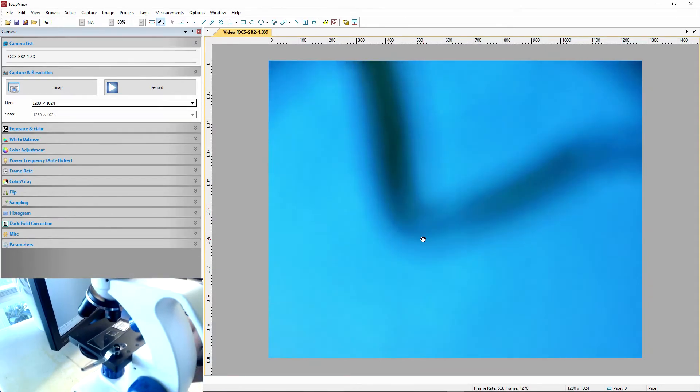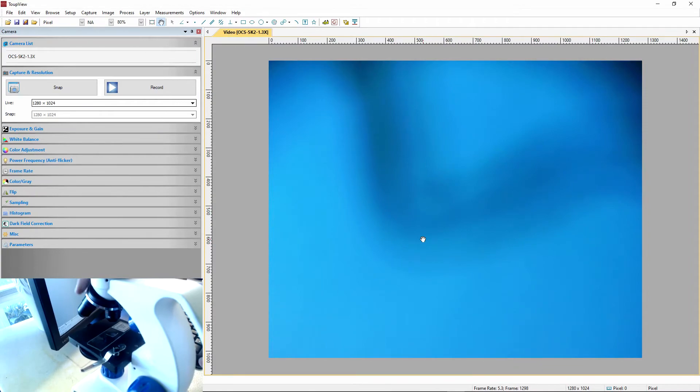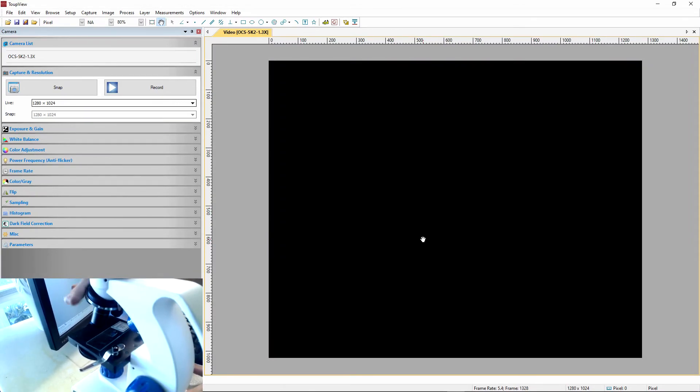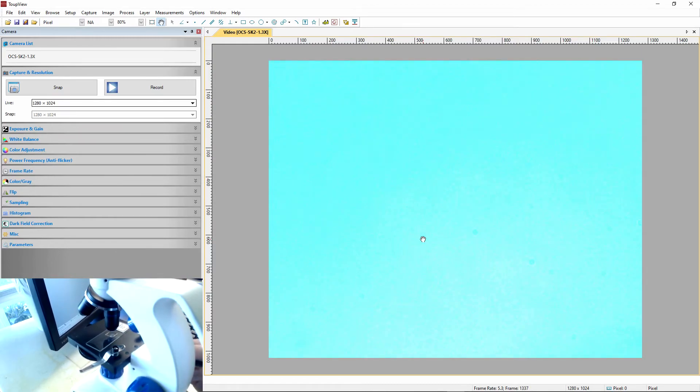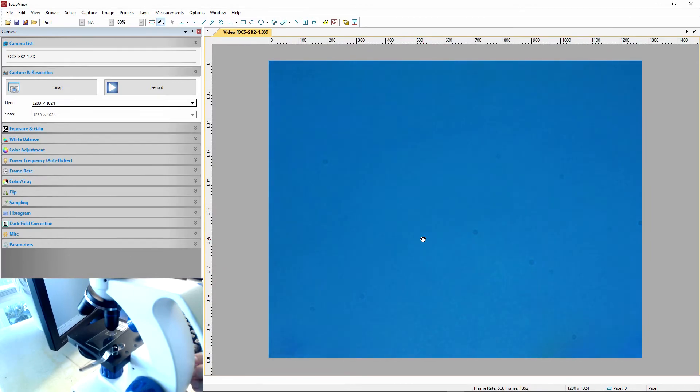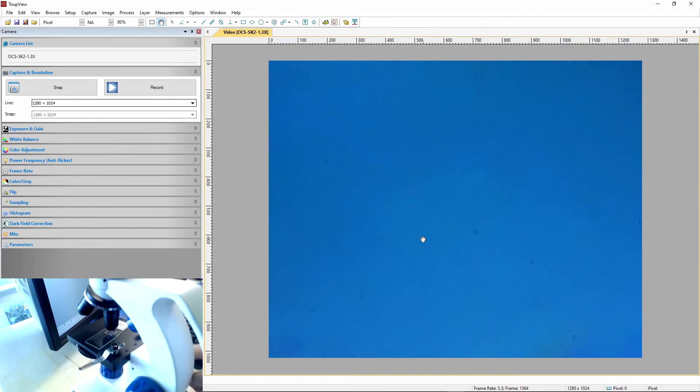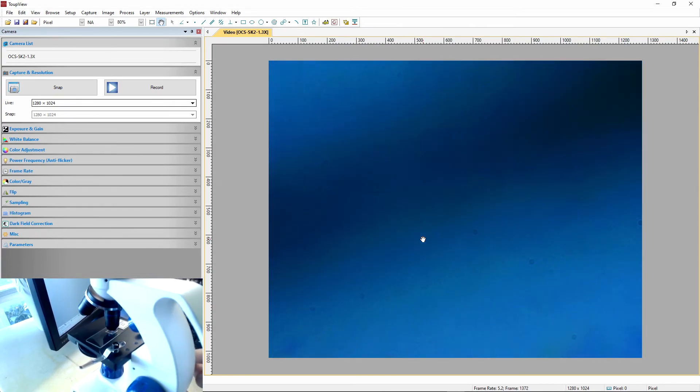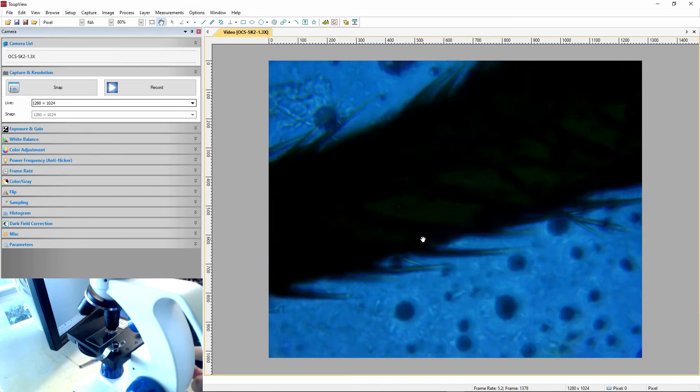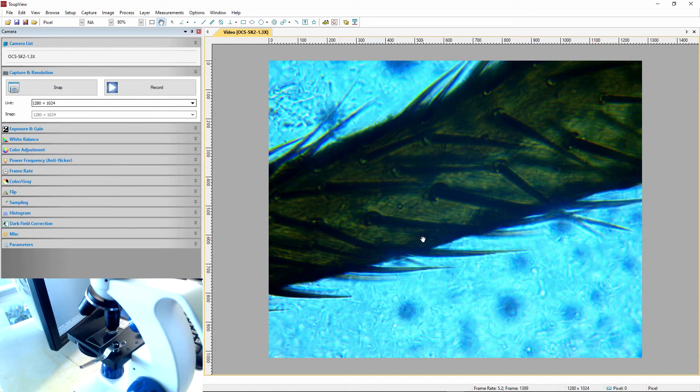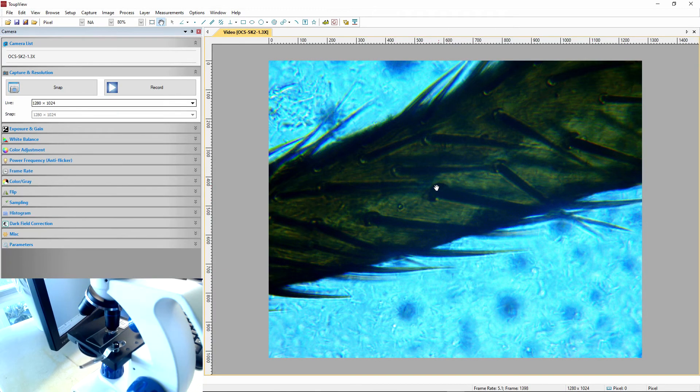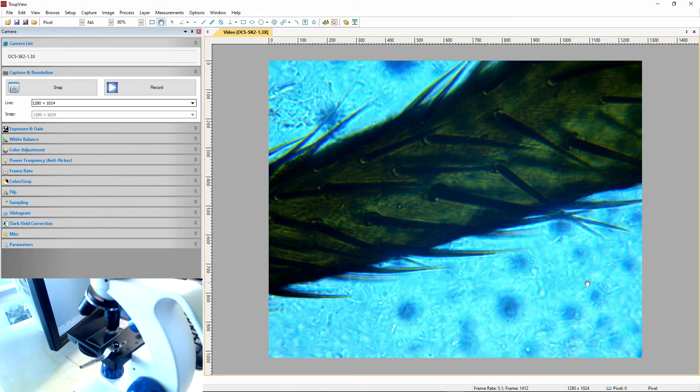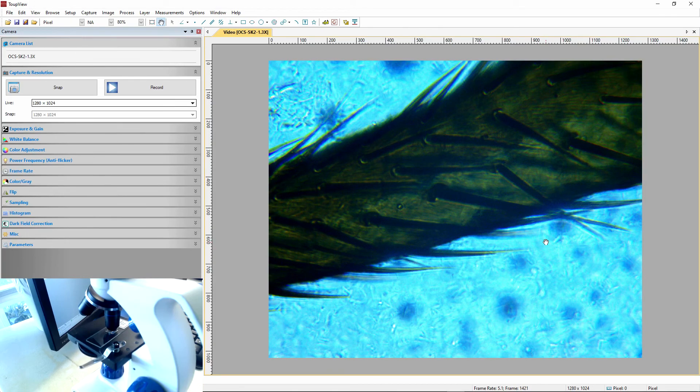Zoom this. All the way out. There. There we go. There it is. Ooh. Wow. That's gross. So you can see where the hairs are attached. Right there. Right there. Right there. And then they kind of stick off. Ew. Okay. Anyway.